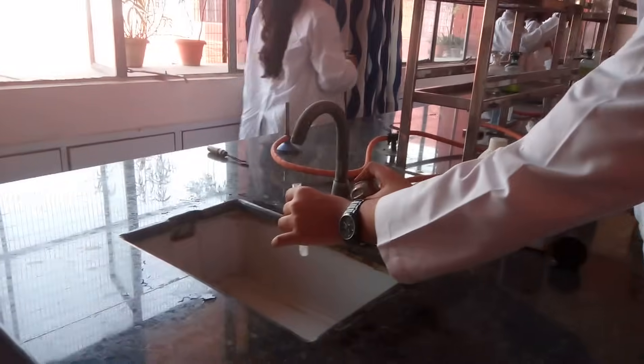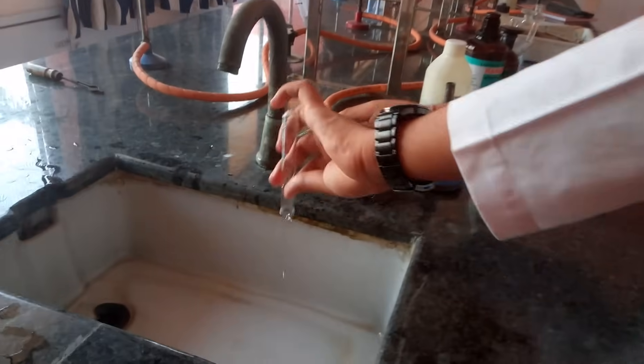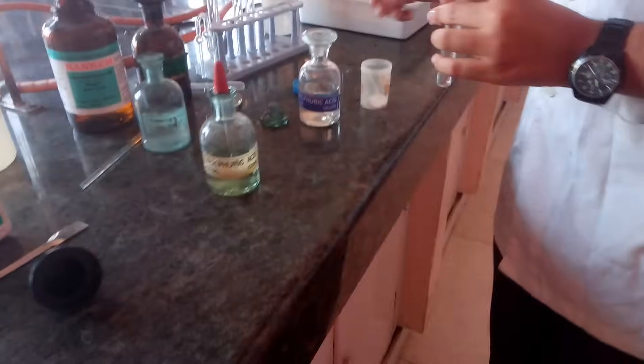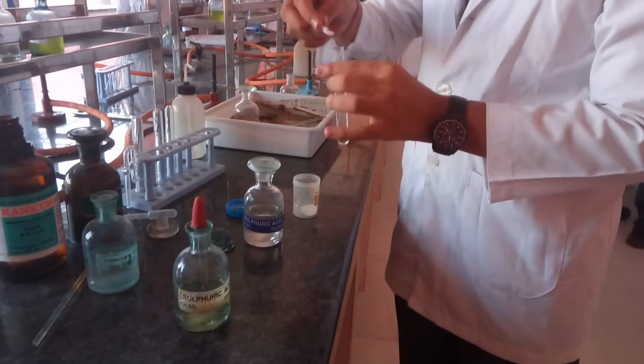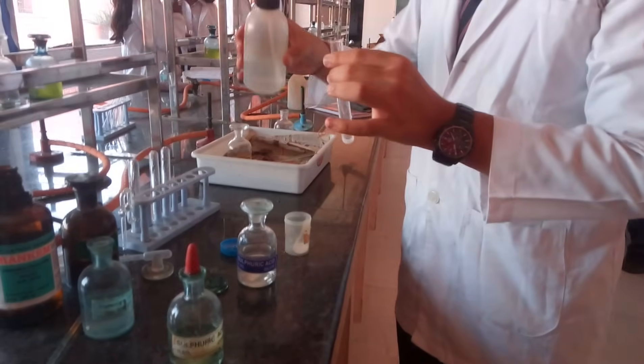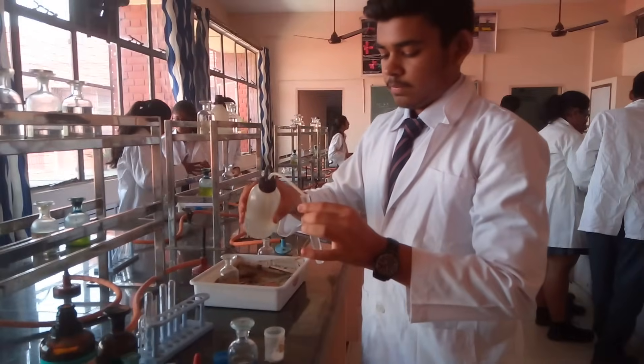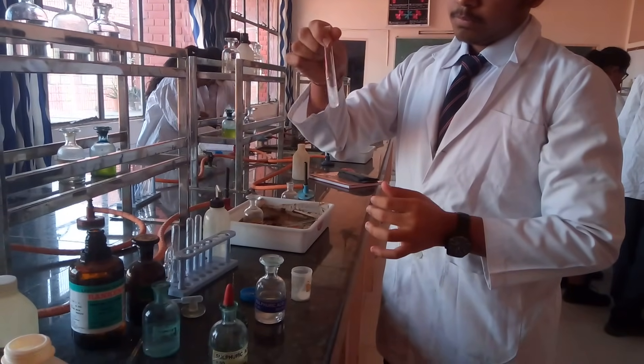Moving to the confirmatory test of chloride, we will discard the contents and use the original solution. In some books it is written as water extract. What do we mean by the original solution? Original solution means salt plus water. Make the original solution. Take a pinch of salt, add water to it, shake it to dissolve it completely.